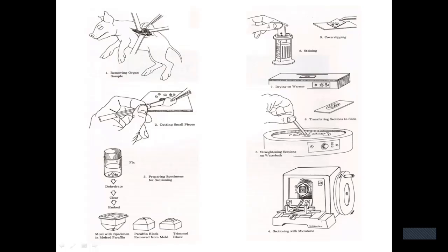Another, staining, which is a very important step. Why is the staining very important? Because most of the cells in the body are colorless. We should stain and add cover slips to preserve the tissue on this slide under this cover. In the final step we obtain the glass slide. Inside the slide is the tissue covered by the cover slip.